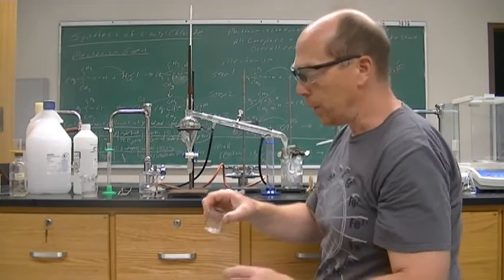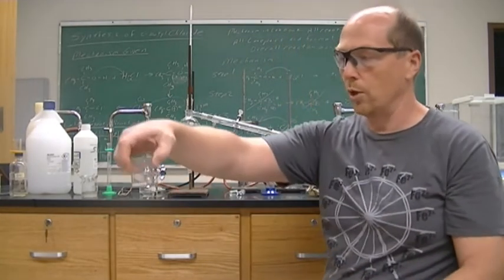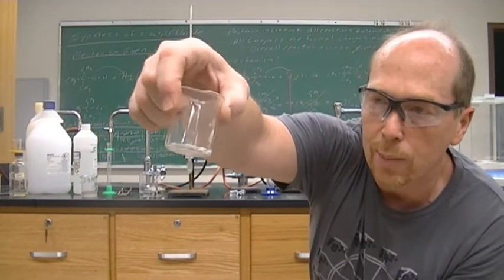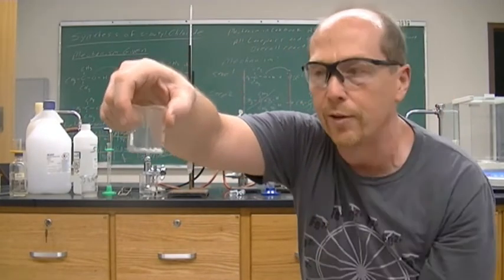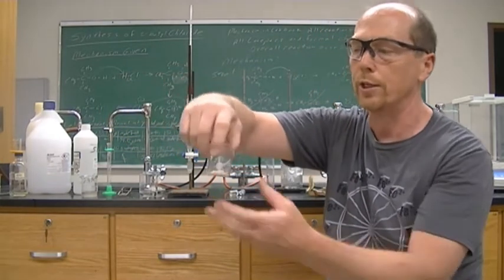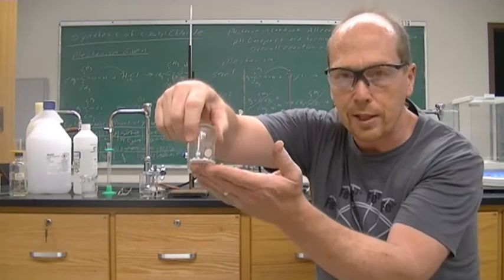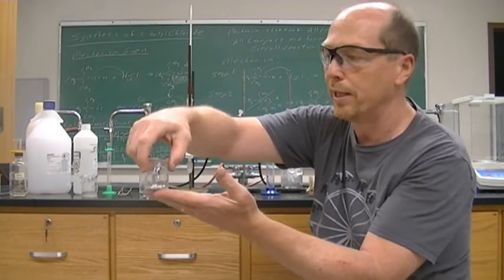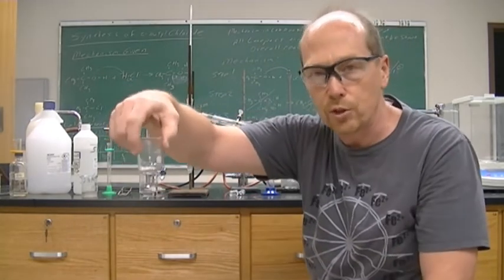All right, but I went out the bottom because I wanted some water to get through, and in this solid, a couple of those chunks are now clumped together, and you know that they have taken in some of that water, so we know it is working. All right, you don't see anything, you don't feel anything. It might be a little warm, but there shouldn't be that much water to make it warm. So it's a very small amount of water.